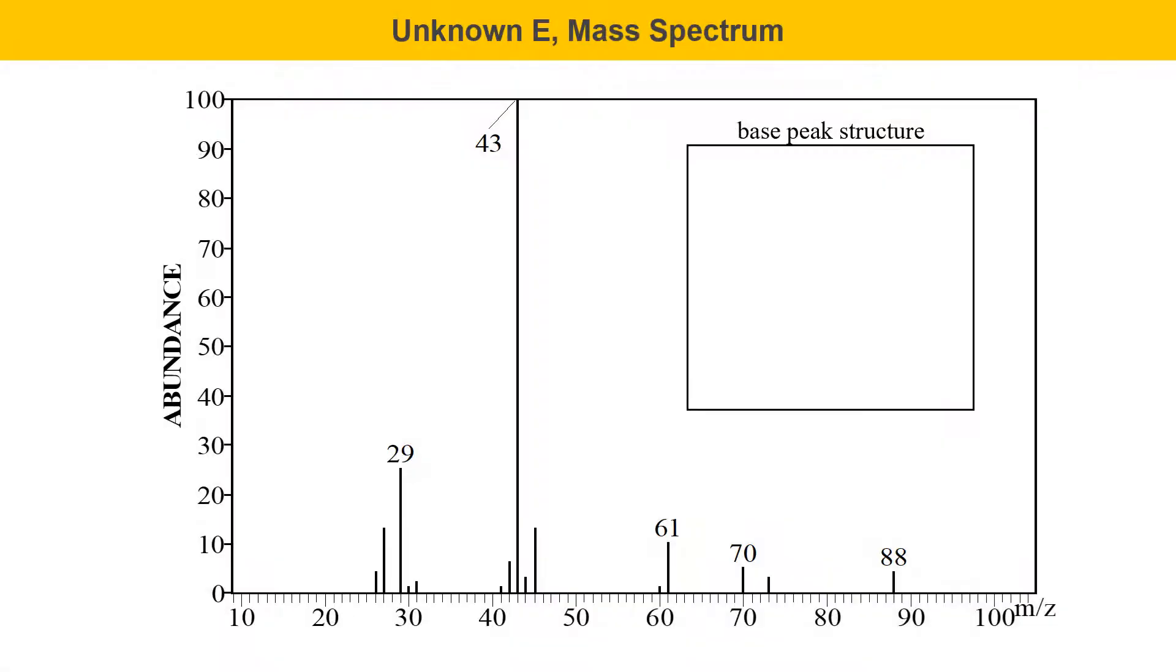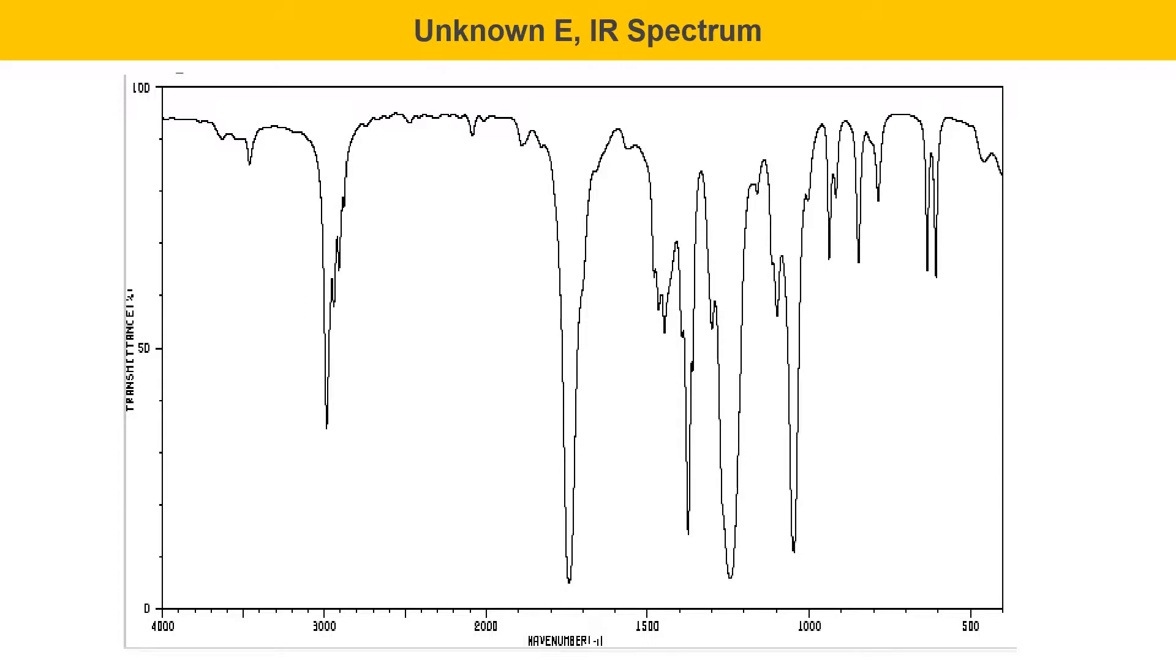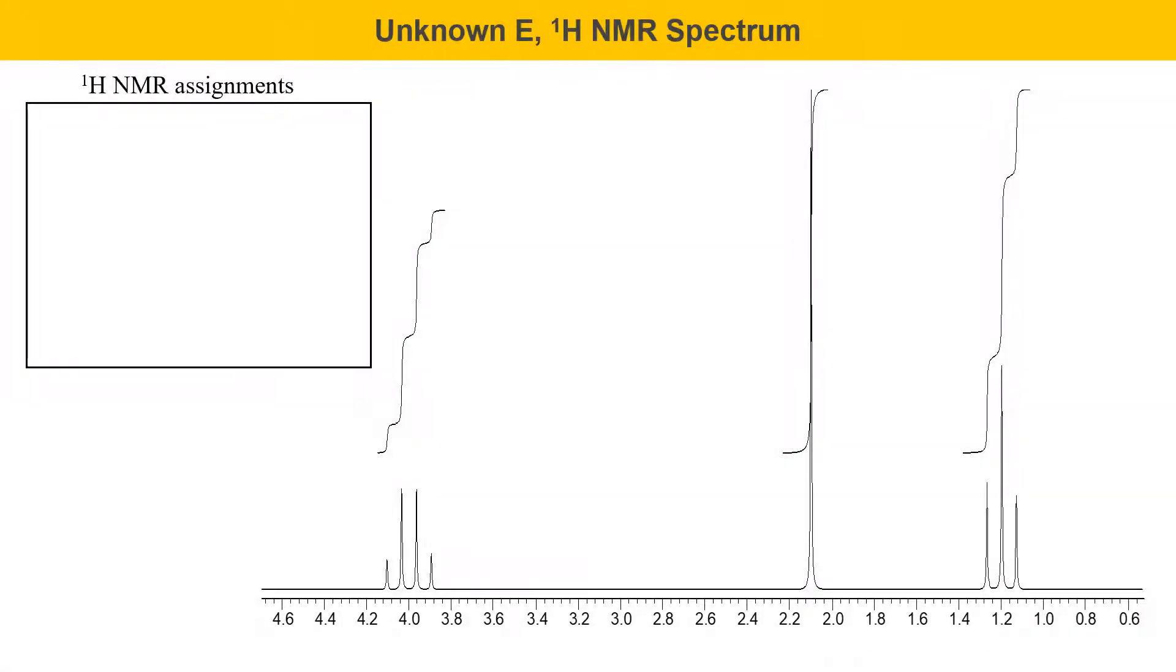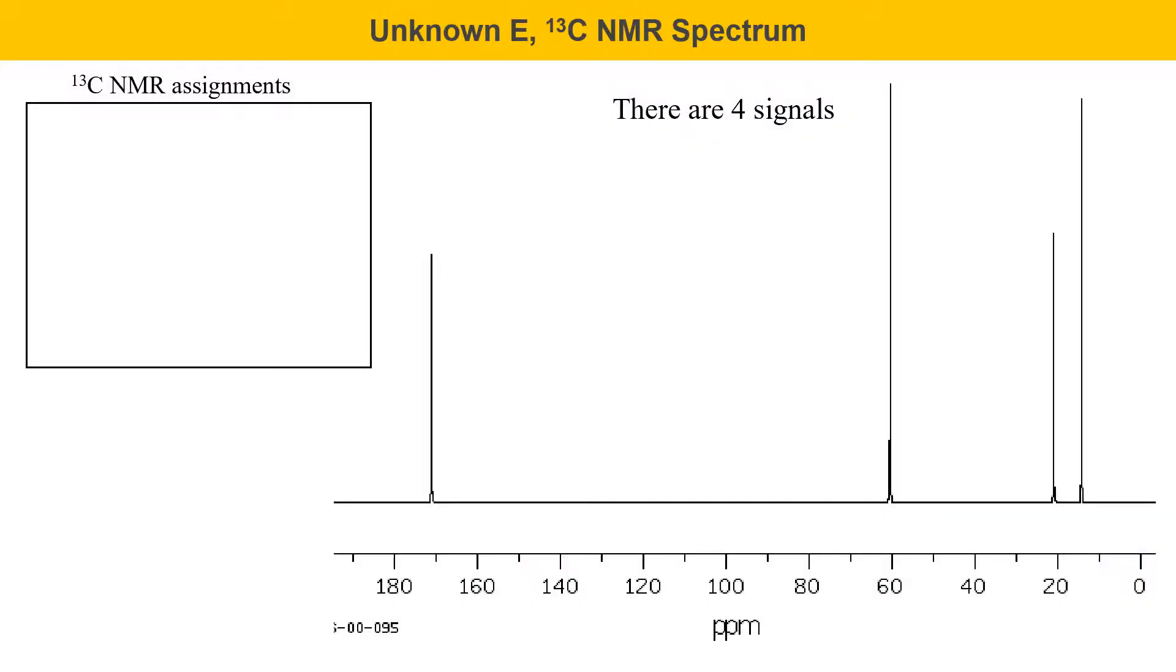Here's the mass spectrum of unknown E. This is a new unknown that we're going to be looking at. Here's the IR spectrum of unknown E. There's one especially strong signal in the fingerprint region just above 1,200 wave numbers that could be significant, in addition to the peaks in the functional group region. Here's the proton NMR spectrum of unknown E. The carbon NMR spectrum for unknown E is shown here. It has four signals. That means there's four unique types of carbon.